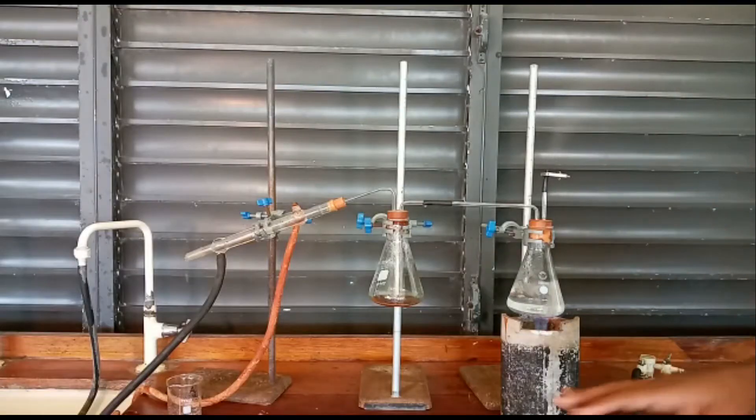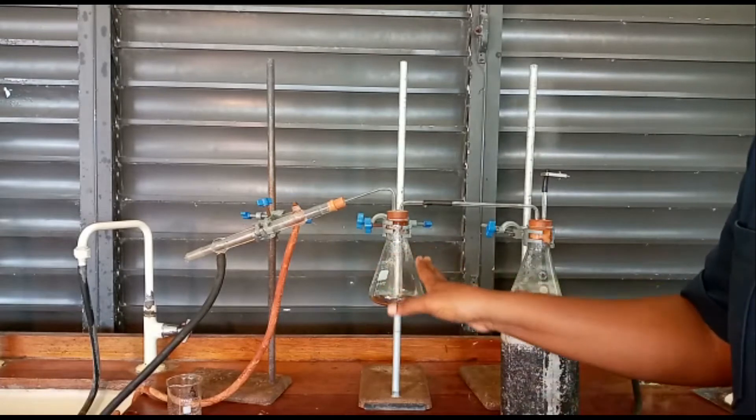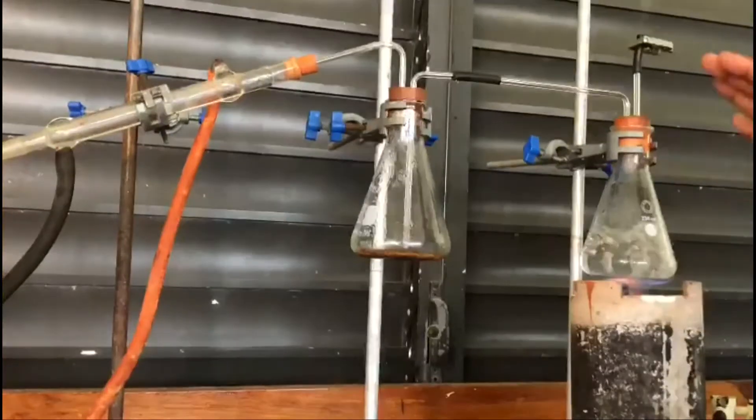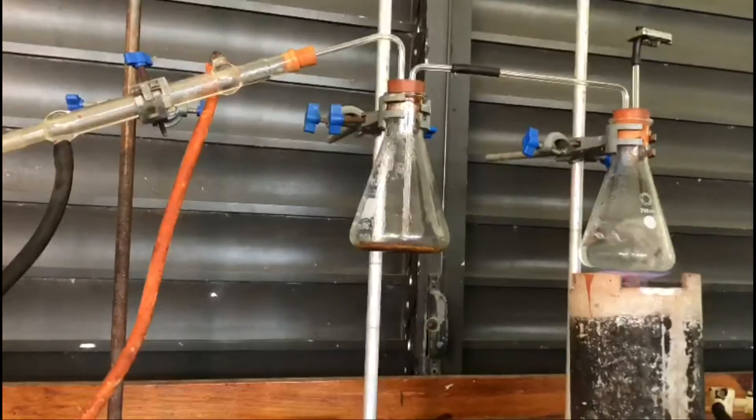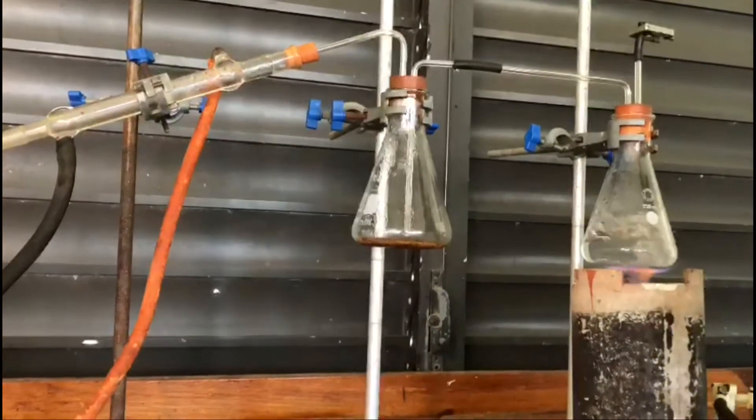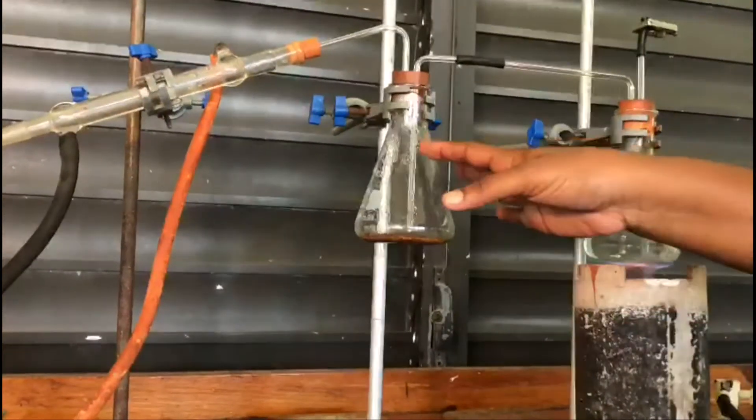One thing to note is that we now have a colorless liquid on the side of the flask. Remember, before we had a dry brown solid, but we're seeing now that we have colorless liquid on the side.